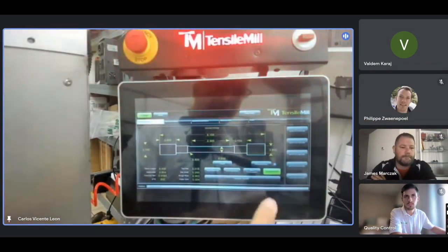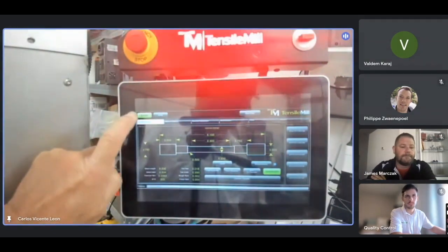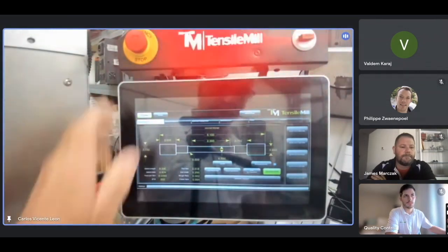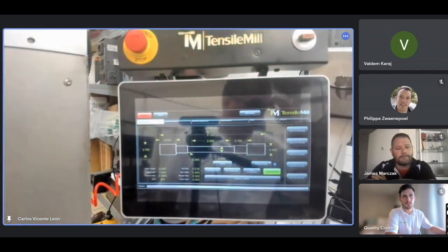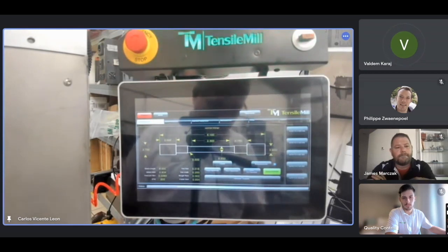Again, and then we press enable on top here. Sometimes it's here on top, sometimes it's at the bottom, depending on the screen you are on. This says enable. Okay, I have enabled the machine. I didn't do anything else, just enabled it.